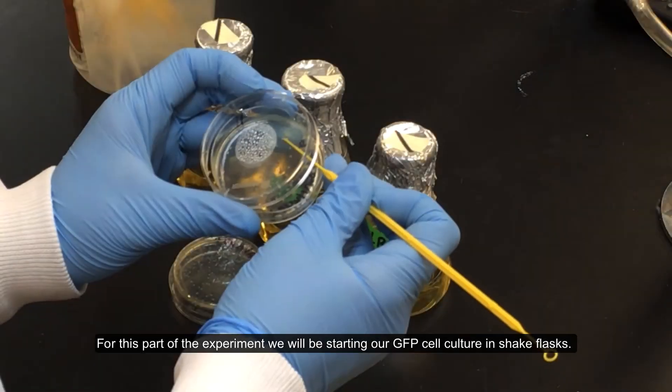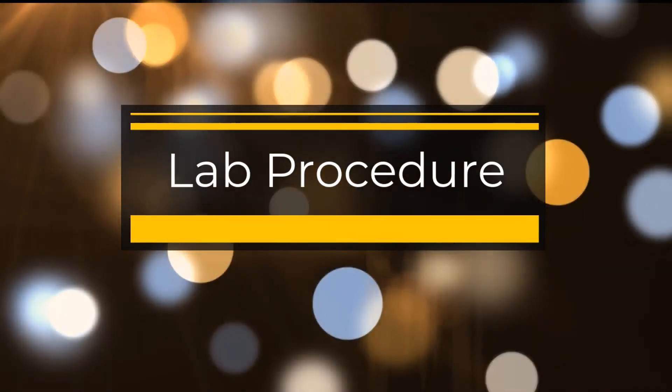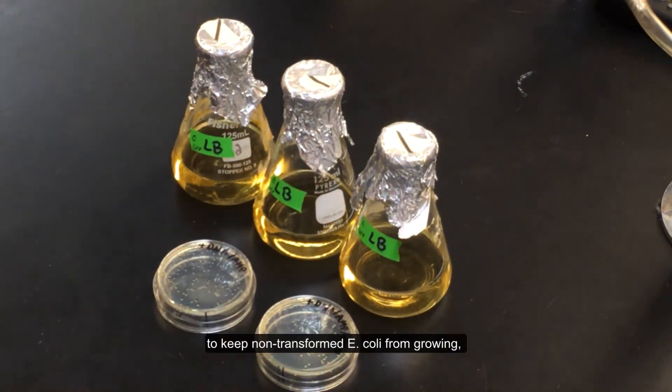For this part of the experiment, we will be starting our GFP cell culture in shake flasks. We will be using LB media that contains 100 micrograms of ampicillin per milliliter to keep non-transformed E. coli from growing, and 0.1 millimolar IPTG to induce GFP production.